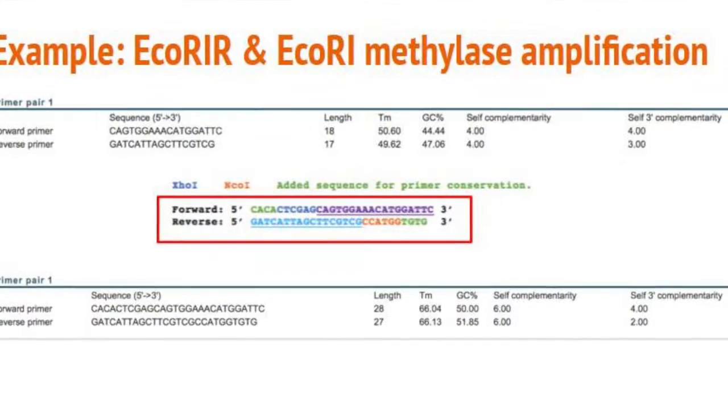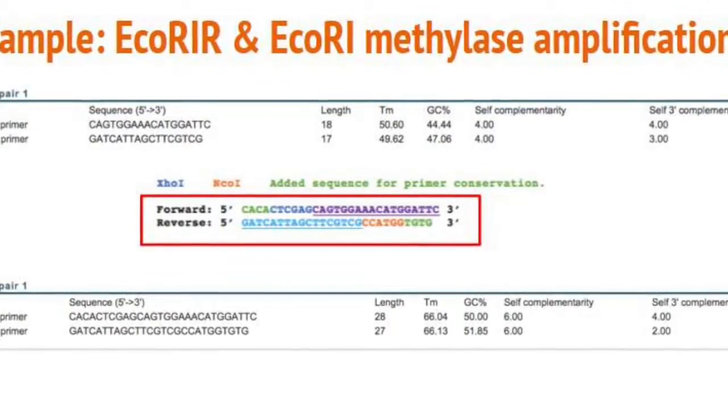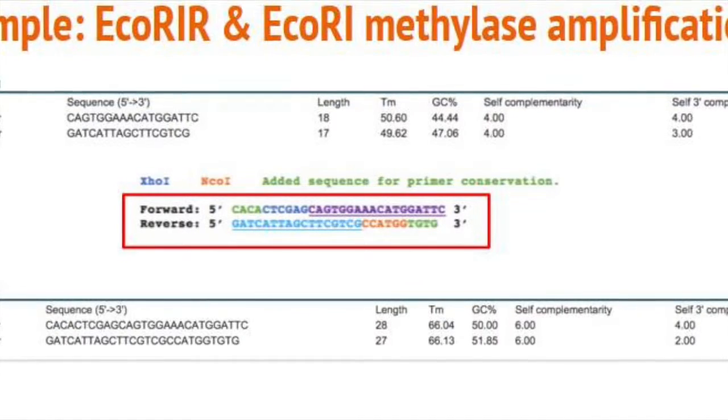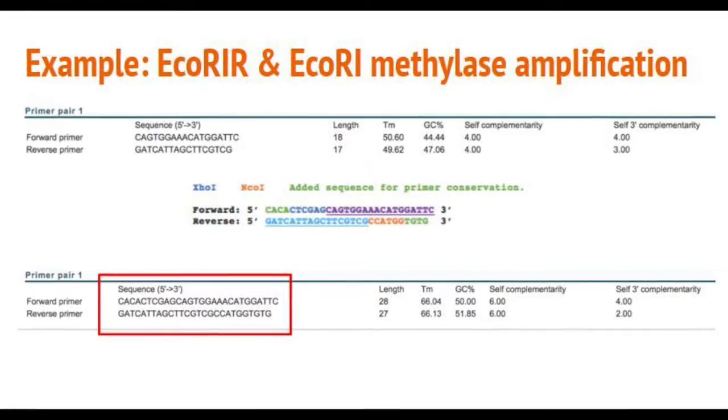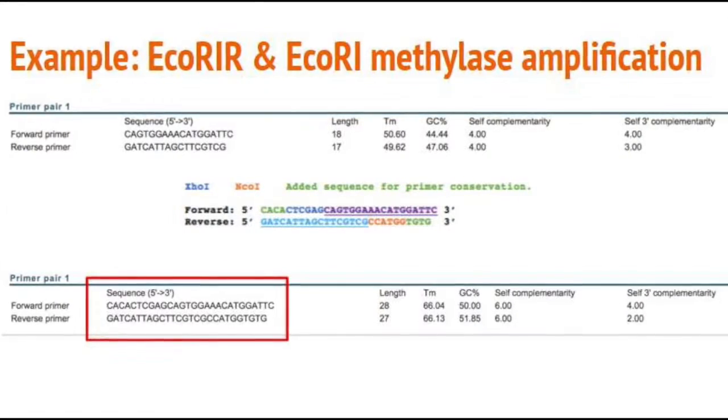In order to clone in an expression vector, it is also necessary to add the restriction enzyme sites to the primers plus random sequences that will protect them from degradation. These added sequences will be digested by the chosen restriction enzymes when they are added to the plasmid.